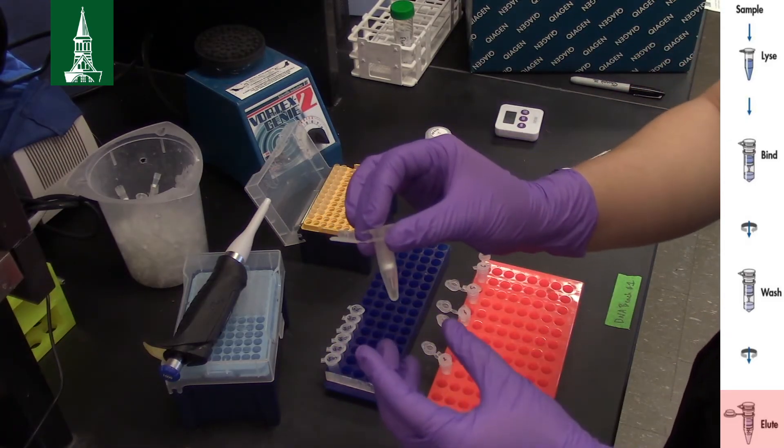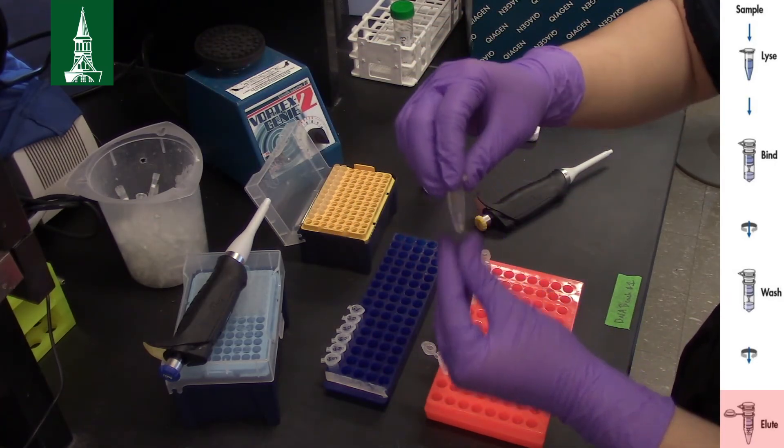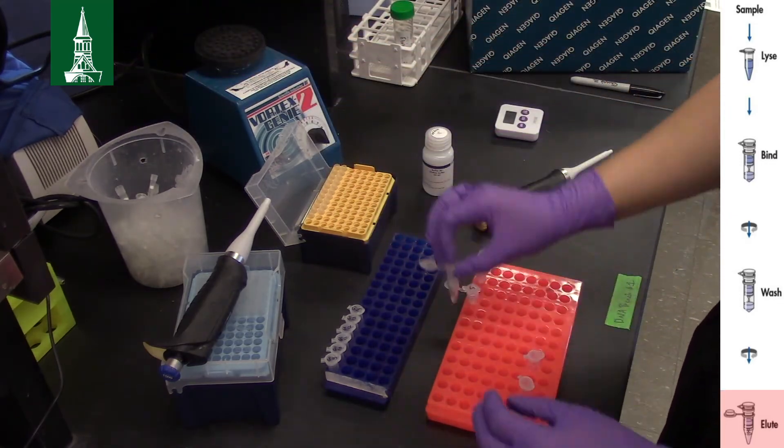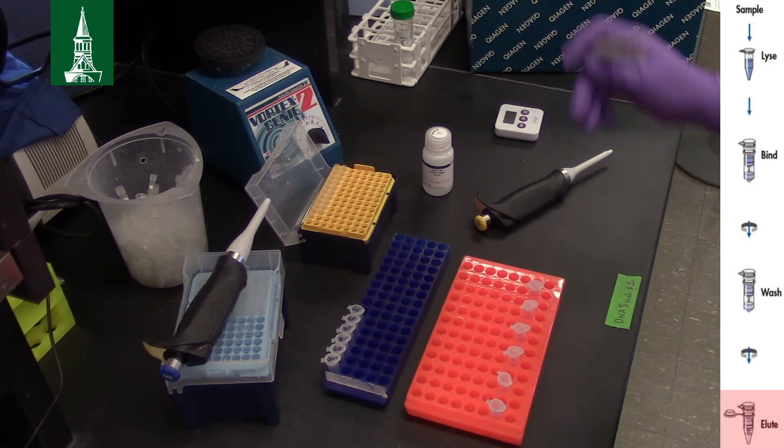Finally, discard the spin columns. Don't forget to label your tubes. Now your DNA is ready to use.